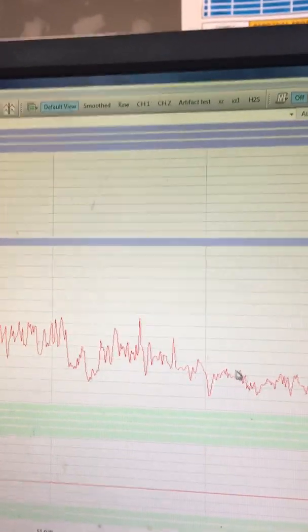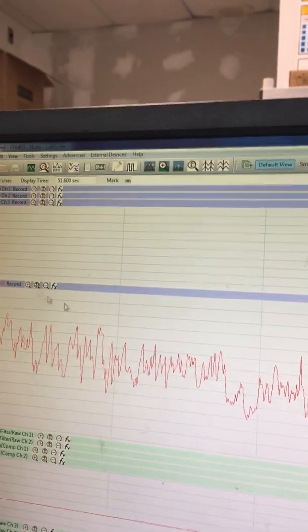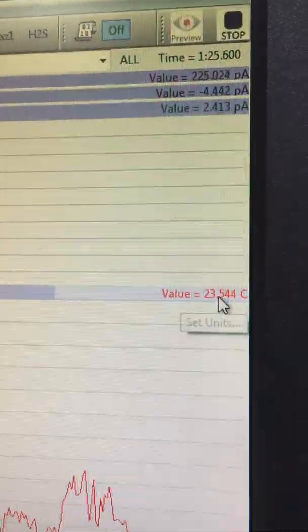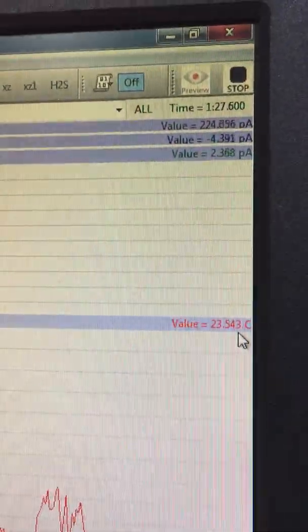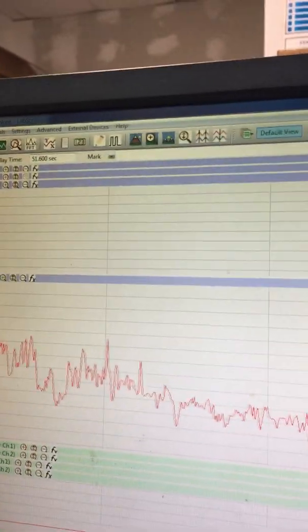So you can see much more noise or a much cleaner way of seeing it. But the temperature that you actually want to record is this temperature, 23.545. The last digit might fluctuate depending on the condition of the room. So this is how the data is presented.